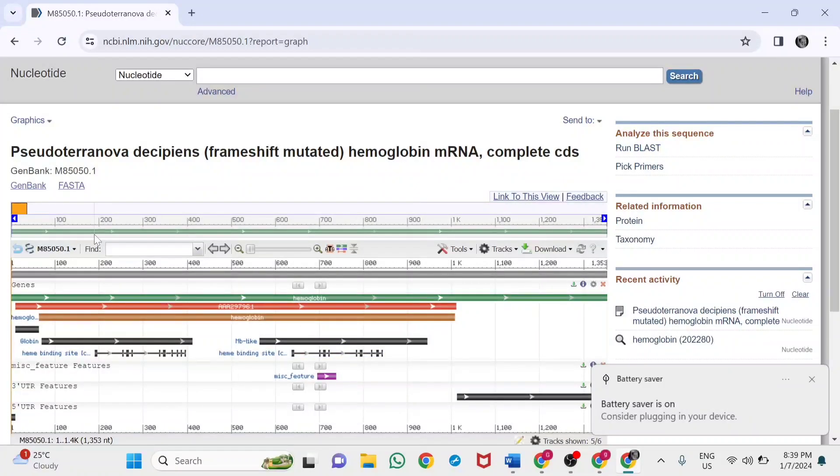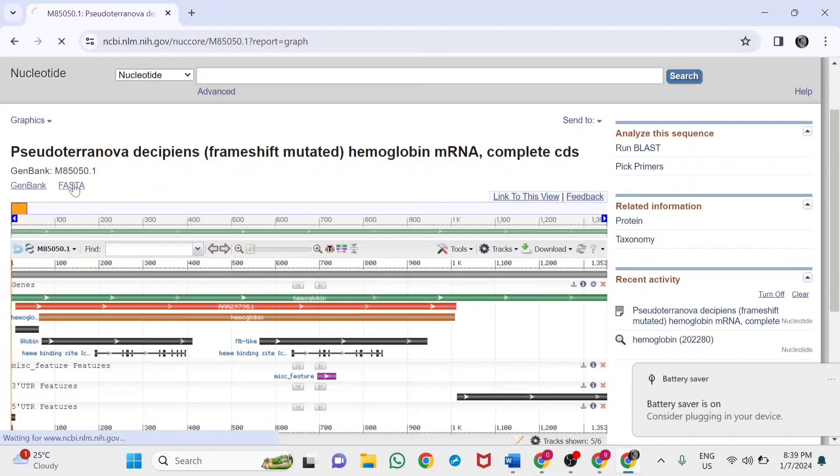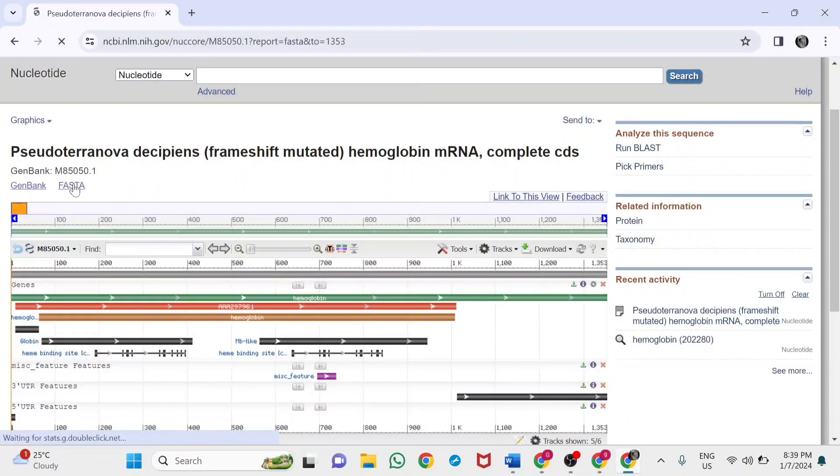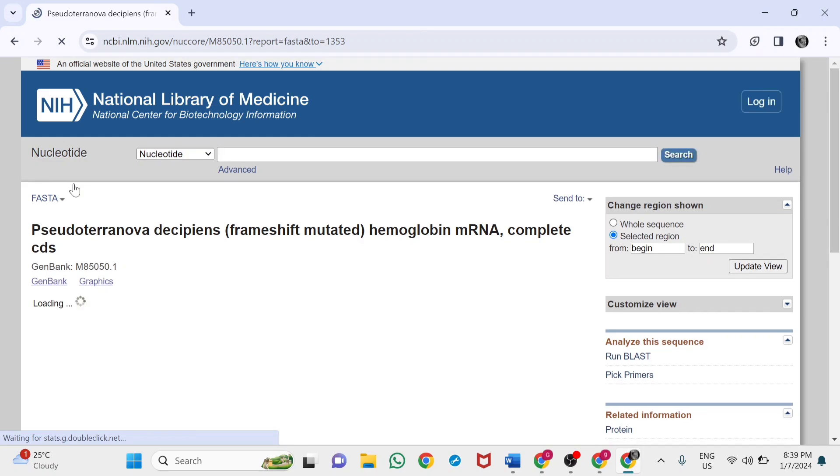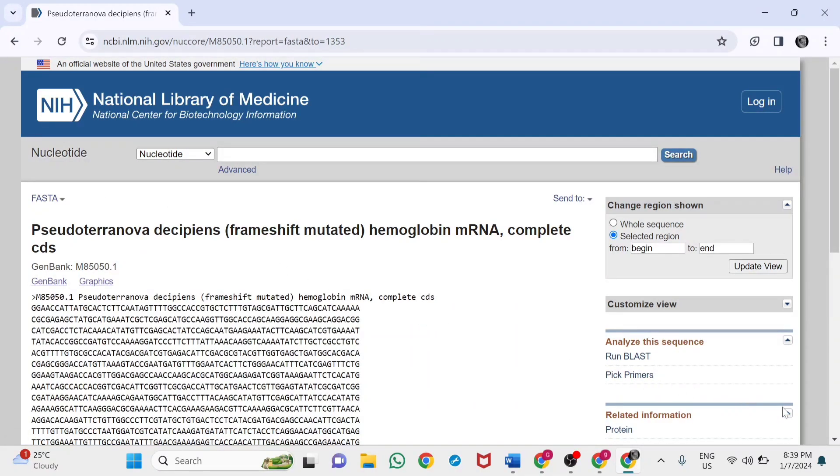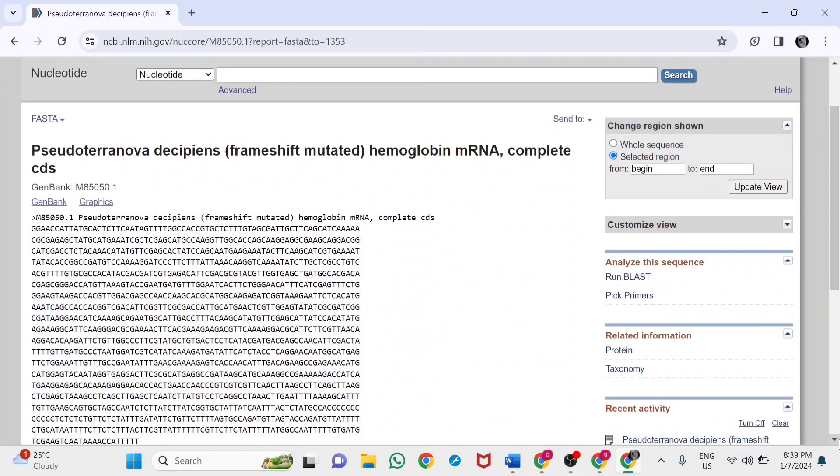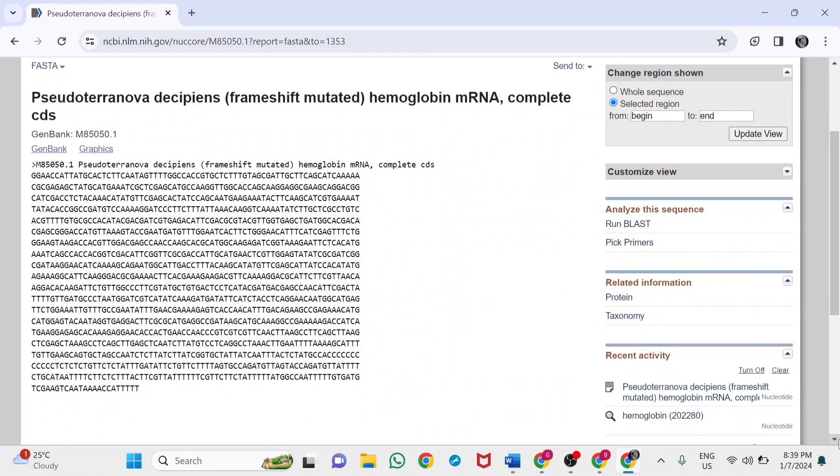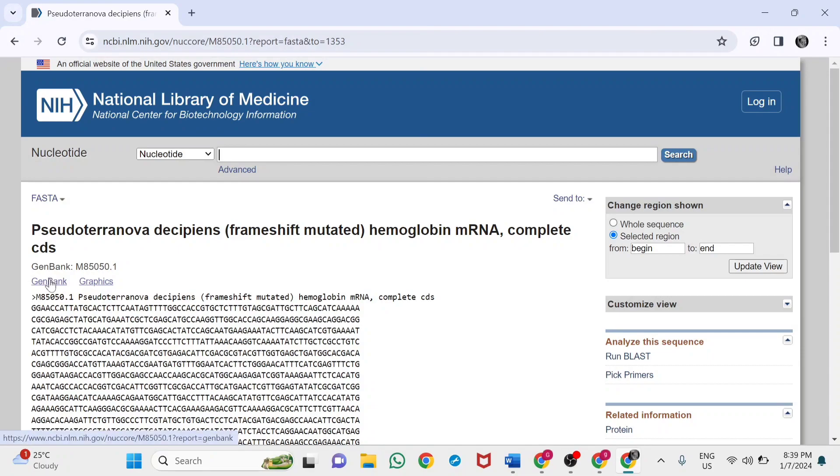This is the graphical format. We can also visualize the sequence in FASTA format or FASTA alignment. It provides a clear view of the DNA sequence. This is the FASTA format of Pseudoterranova decipiens. We can also go to GenBank and download this format.